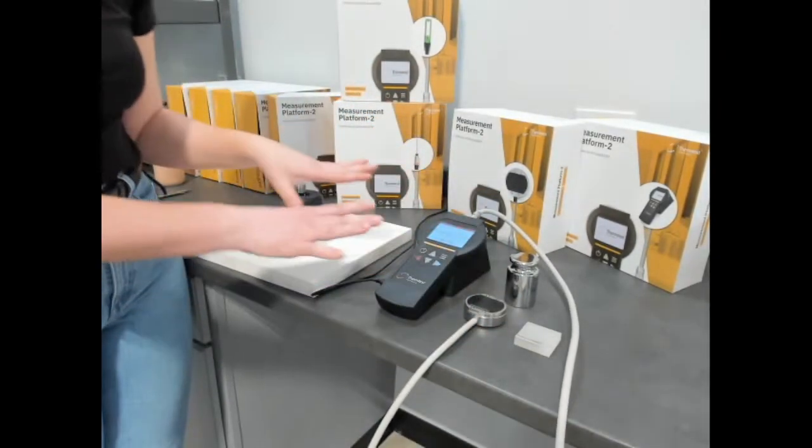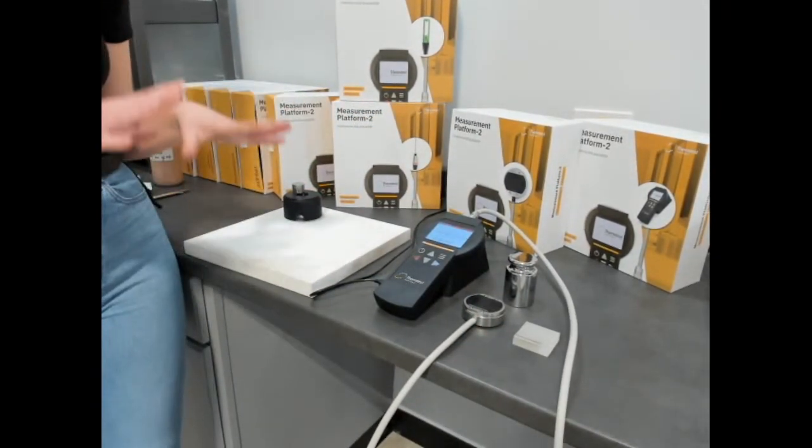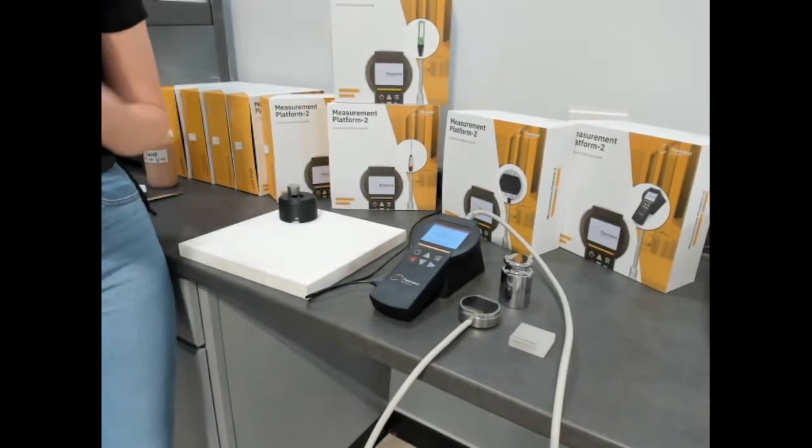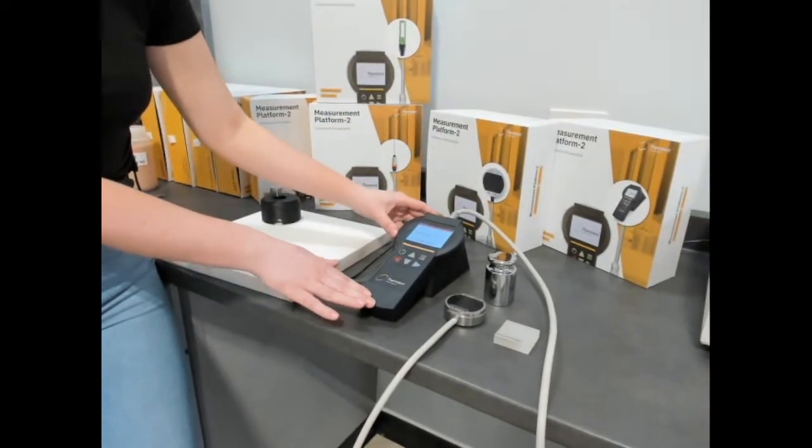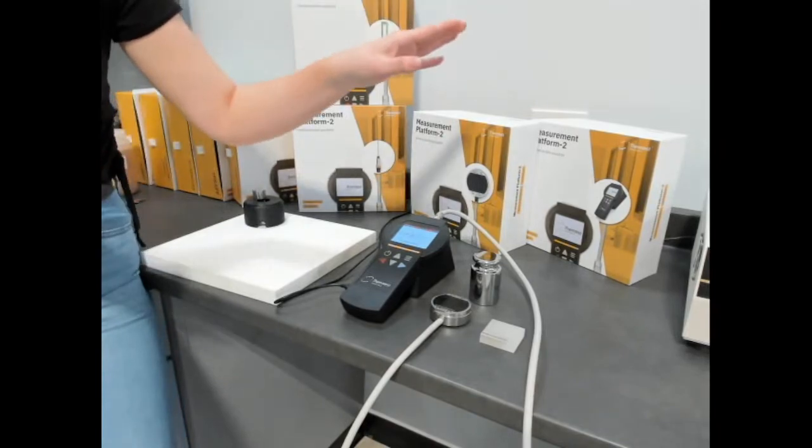To perform measurements with the MP2, you can either set up an automated schedule of measurements with a set period of time between each measurement, or you can run single tests. The automated schedule can be done through the MP2 instrument itself or through the software.